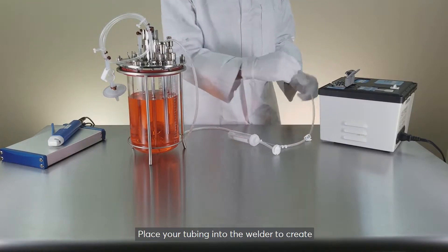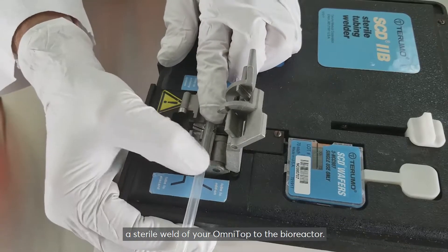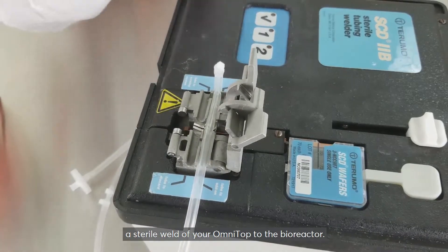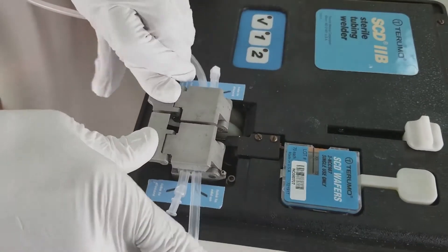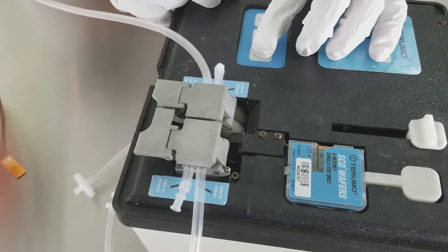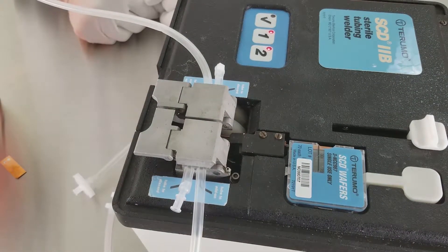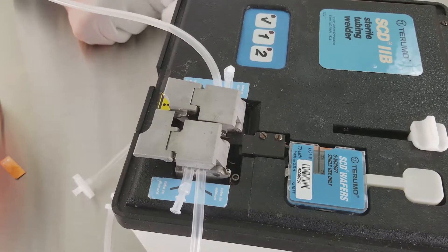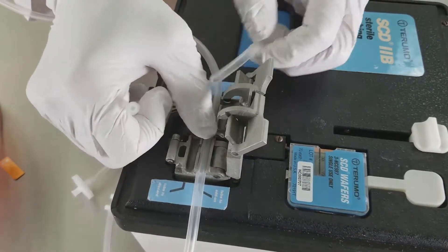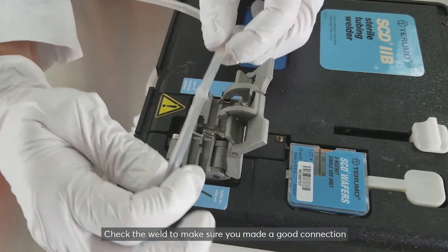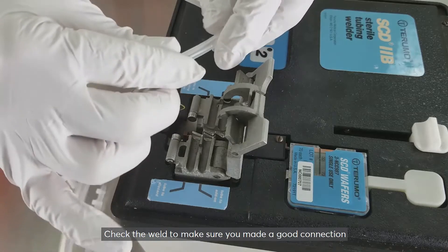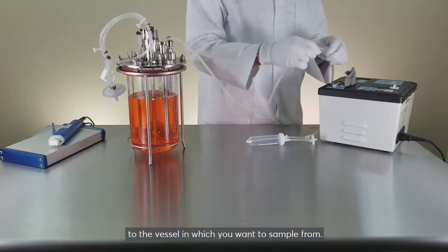Place your tubing into the welder to create a sterile weld of your OmniTop to the bioreactor. Custom connections are available too. Check the weld to make sure you made a good connection to the vessel in which you want to sample from.